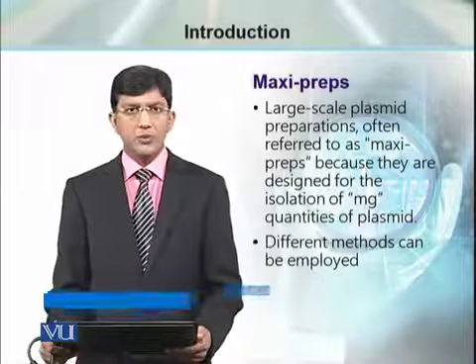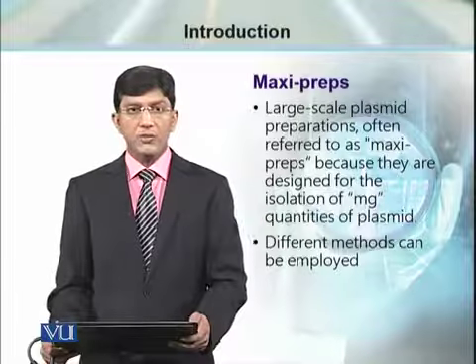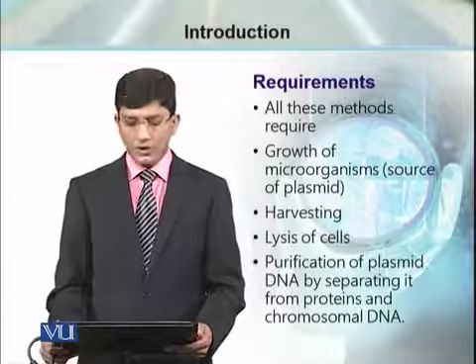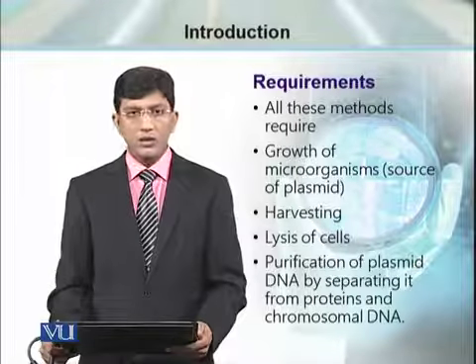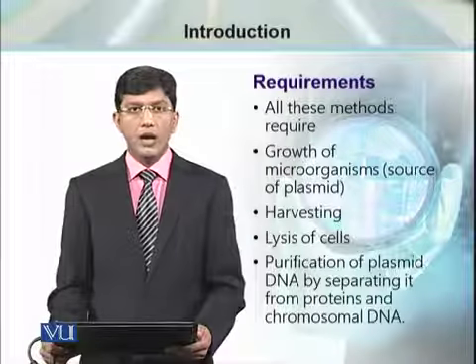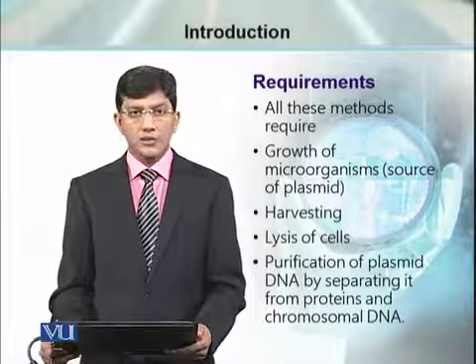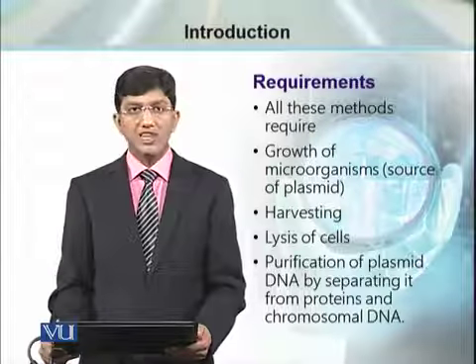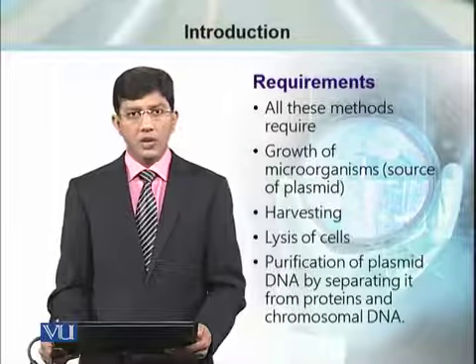There are different methods which can be employed for maxi-prep, but in all the methods, the steps are more or less similar. What we need for maxi-prep is the same as we talked about in mini-prep. For example, we need growth of microorganism as a source of DNA or the plasmid DNA, harvesting of these microorganisms, then lysis of the cells to isolate the DNA, and then purification of the plasmid DNA from cell debris, which contains the proteins, particles or parts of the broken membranes and the genomic DNA.